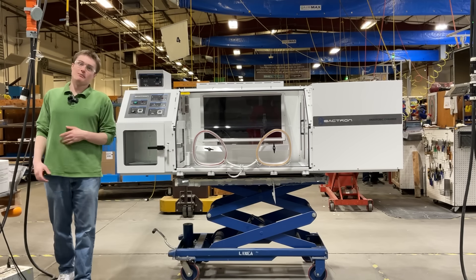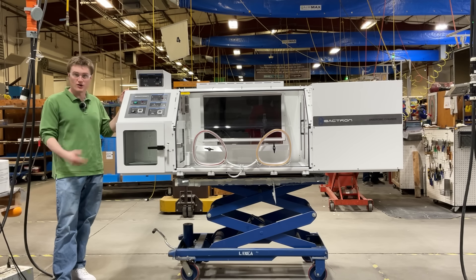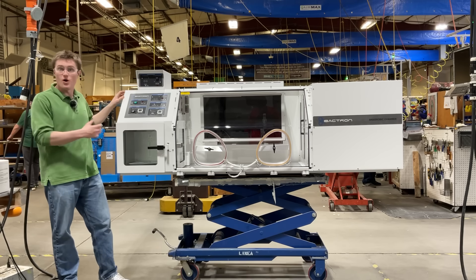Hello again, my name is Kord Singstick. I'm a design engineer here at Sheldon Manufacturing, and today I'm going to be introducing the Bactron 900 anaerobic chamber — a spacious anaerobic workspace that combines our Bactron 300 and Bactron 600 into one package.